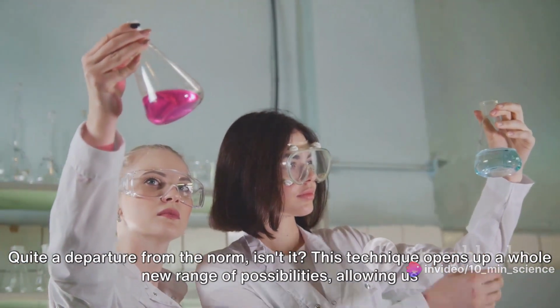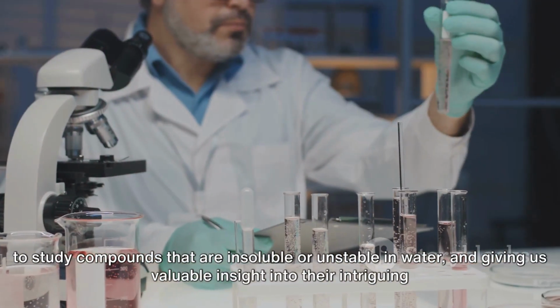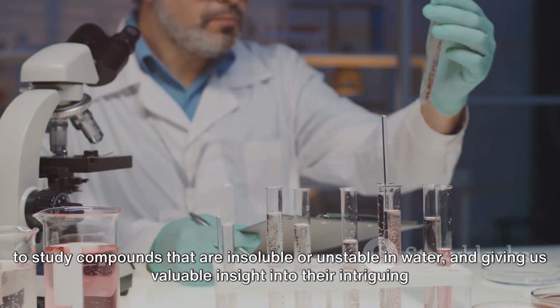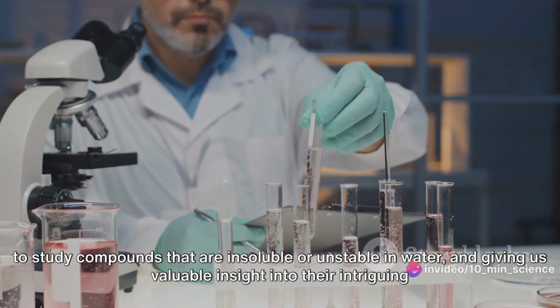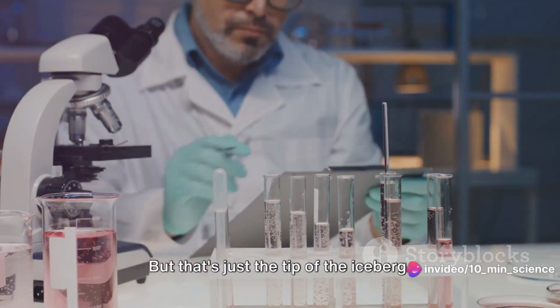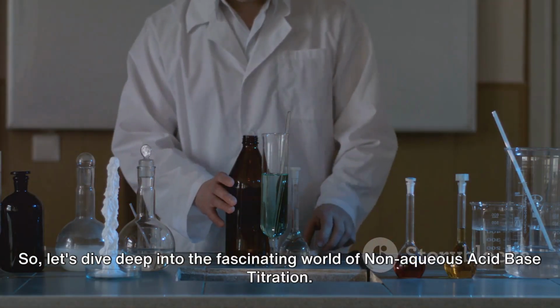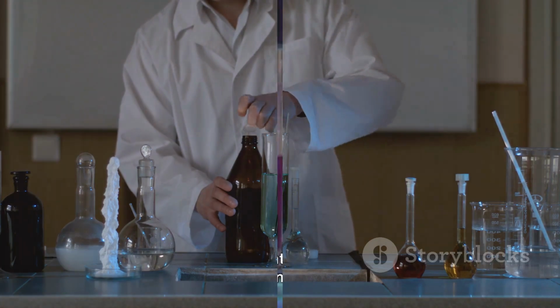This technique opens up a whole new range of possibilities, allowing us to study compounds that are insoluble or unstable in water, and giving us valuable insight into their intriguing chemical properties. But that's just the tip of the iceberg. So, let's dive deep into the fascinating world of non-aqueous acid-base titration.